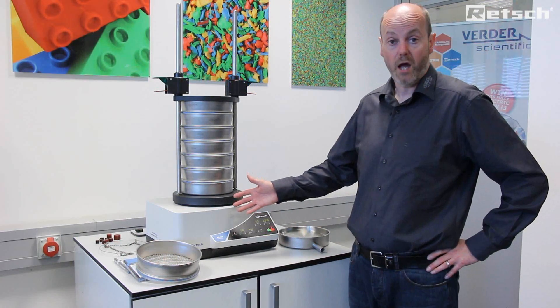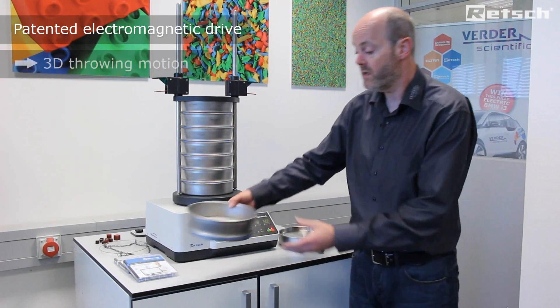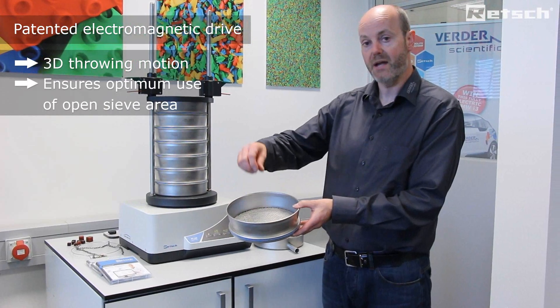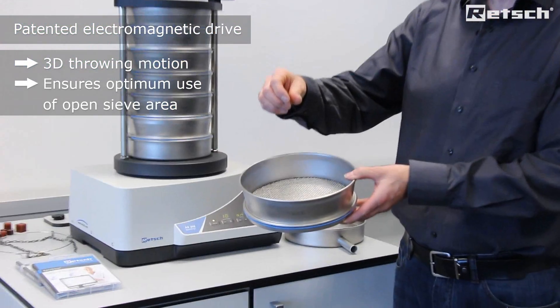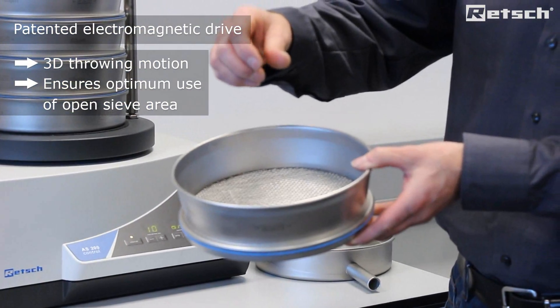The instrument is supplied with a patented electromagnetic drive which allows materials to be thrown away from the open mesh surface in a three-dimensional throwing action, allowing the materials to be presented to the open sieve mesh in all orientations prior to characterization.